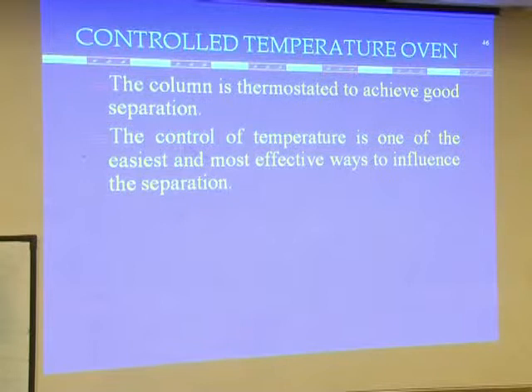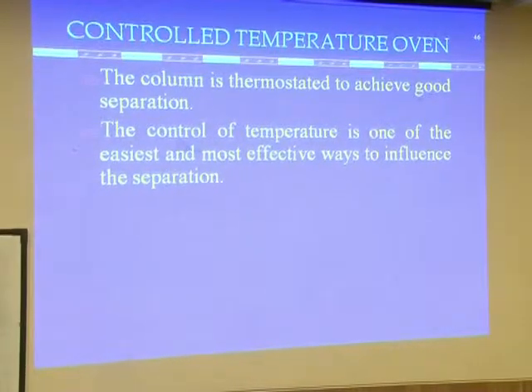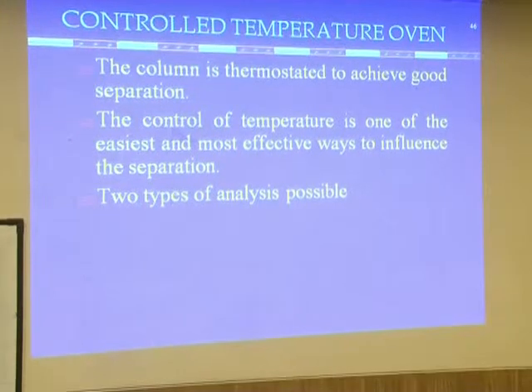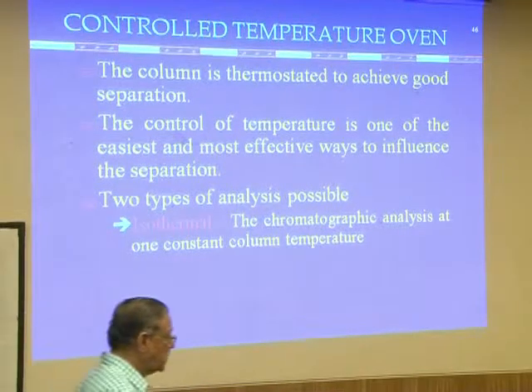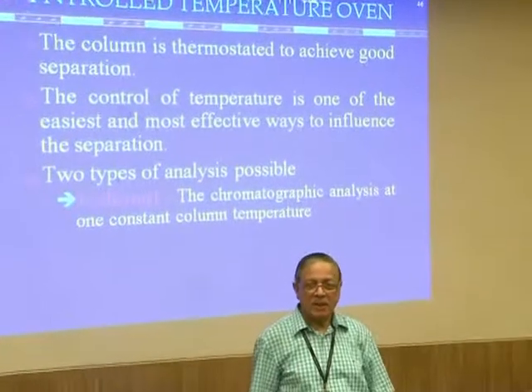Now, column we have seen is thermostated inside the oven, and because the temperature has to be kept constant, two types of analysis are possible. Iso means same. Thermal, same temperature.